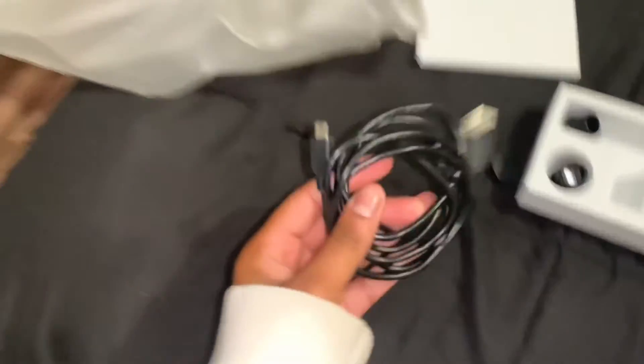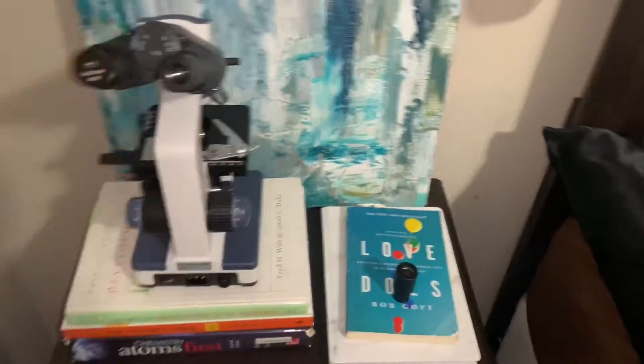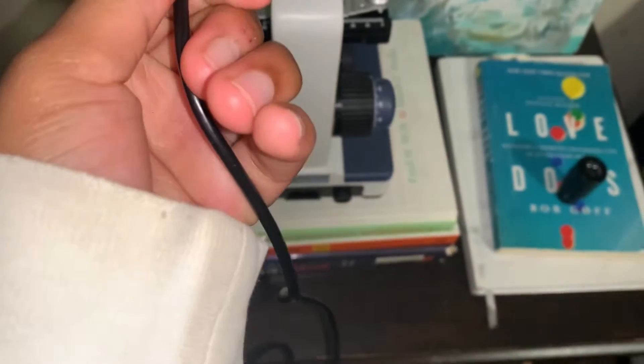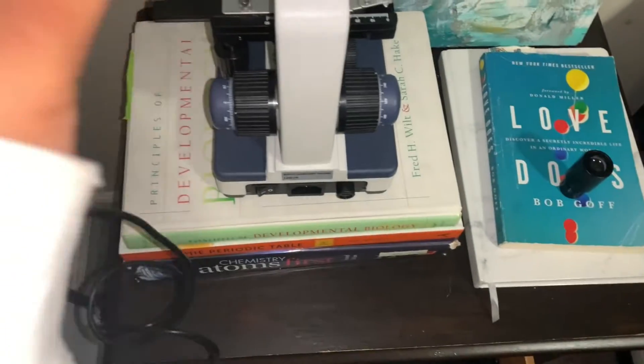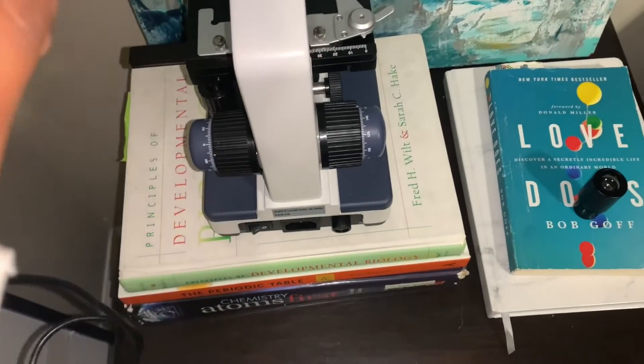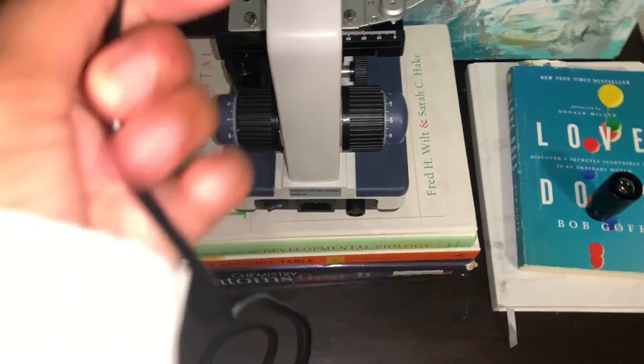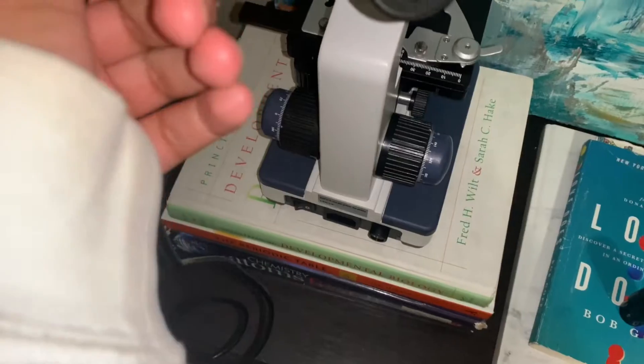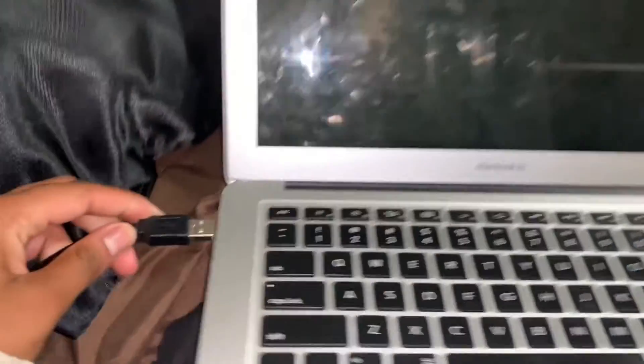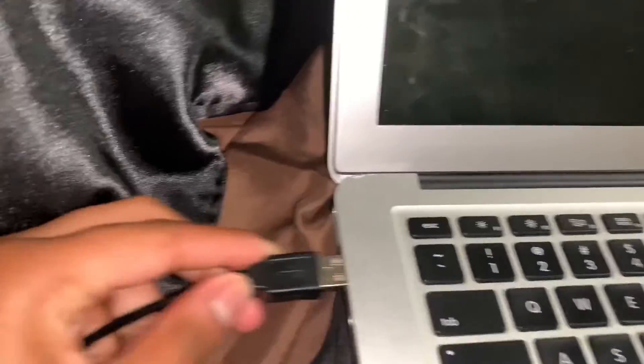Now I'm going to take the USB cord and connect it to the microscope. Now I'll connect the other end to the computer.